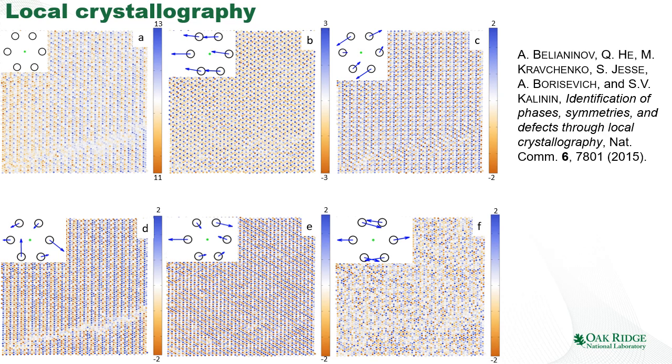That's rather interesting because it seems that the antiphase boundary is associated with the suppression of specific distortion components. For example, distortion component number 4 is non-zero everywhere except for the grain boundary. It almost looks like an order parameter field where the grain boundary suppresses the order parameter. So this is a very interesting analogy between these statistical normal modes and the classical order parameter theory, which we are still exploring, and we'll talk about it in the subsequent lectures.